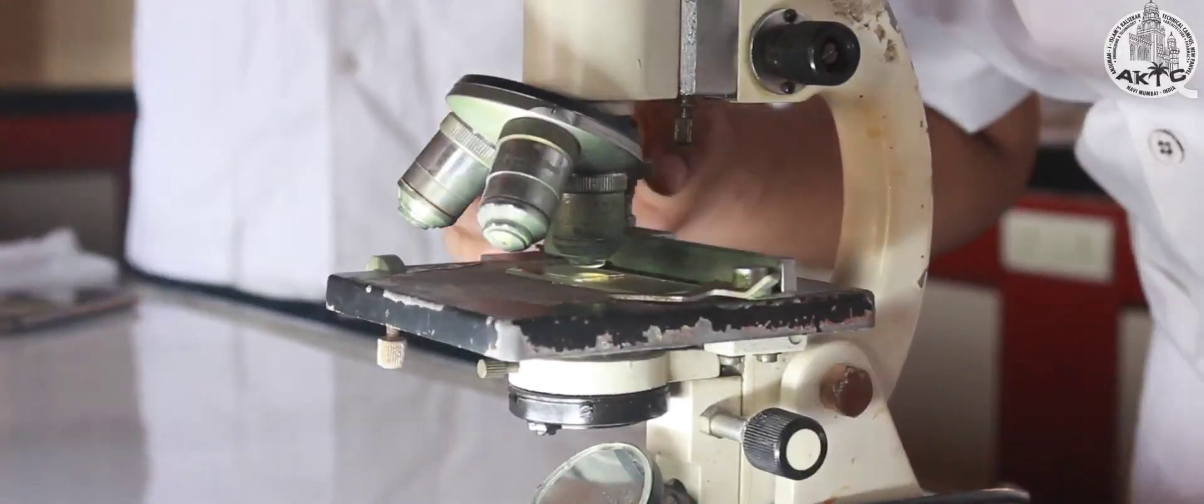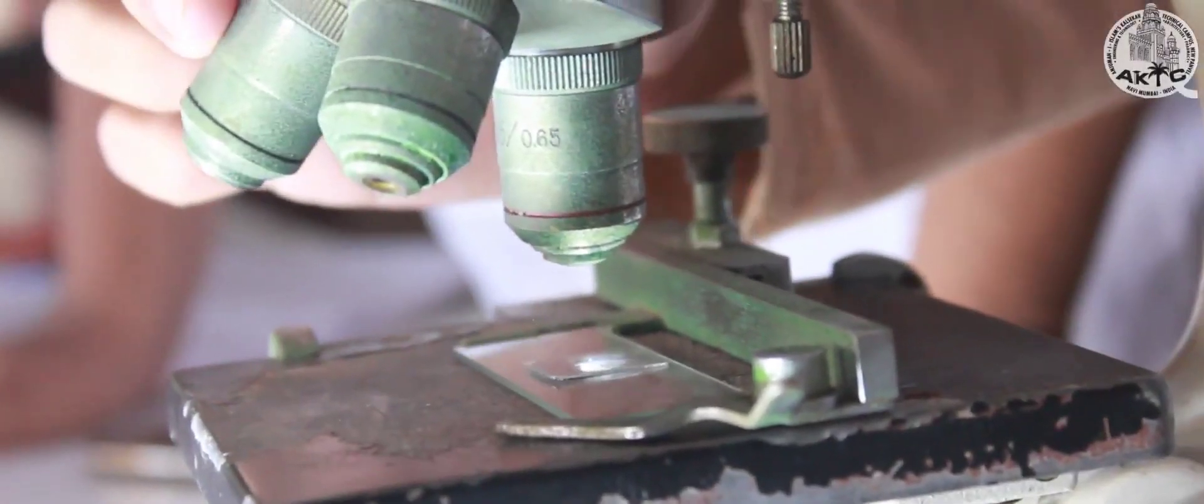Mix it and put a drop of glycerin over it. Place the cover slip avoiding any air bubble under it. Watch it under the 10x objective and then later 45x.